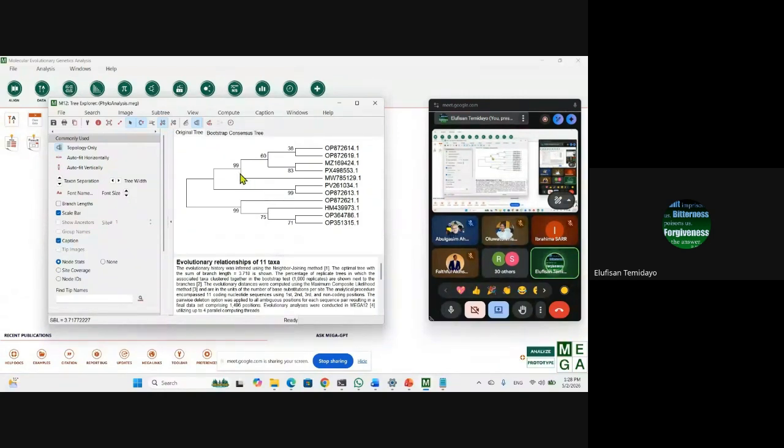Okay? And the same thing here. Look at this guy. This 36% is telling us this and this have come from the same ancestor, but 36 is very low. Anything less than 50% is not true. So this is not true for this tree. These guys are not family. For example, if you were saying that possibly they might have been the same species, no, it just groups them together because it has nowhere to place it. Because 36 is far less than 50%, and 50% is not good enough to be considered from the same ancestors. There are so many things that are not related between them.